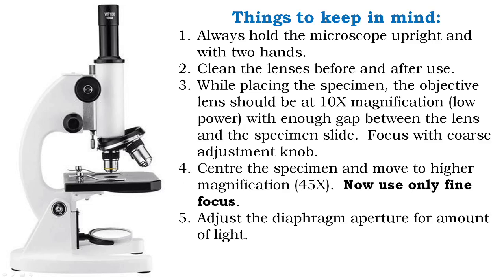So higher magnification 20x in sigre, 45x in sigre, so 45 de gale yomare. 100x che yodi shuma kiranzu college ta tendo pheje che ra to gor 100x la du zambala oil immersion pheje che gor para de la numlu na ni shine ya se u thoye jo 100x pheje che du zambala so ngazu de la 100x yomar ti du zambala kiranzu de same de che goy mindwa. So, mazu de la khare yore 10x, 20x, and 45x lan yor. So, kisi kiran zu gita 20x, 45x kan la ya drawa yin bai na.